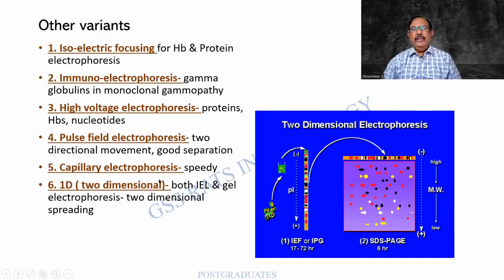Usually in a separation, it will be in a single dimension along the length. But here, after some time, you find that there is another dimension also. That is why it is called 2-dimension. So I am finding the material getting scattered as such, which can be read by the physicist rather than us.